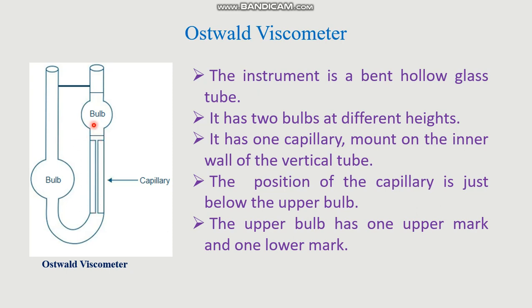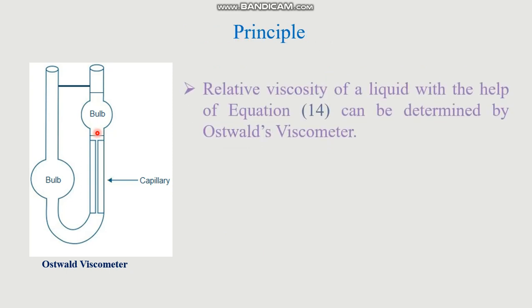After some time t, the lower mark of this bulb will be touched and the overall time is recorded. So what is the principle?